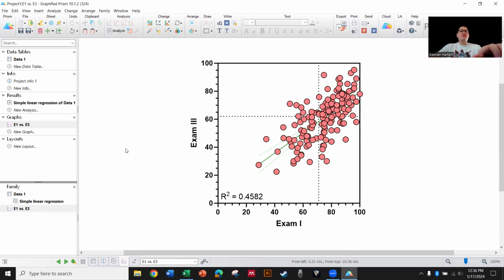If you're running a bunch of repeated analyses too, you can actually set up an R2 equals with nothing next to it and then copy paste this value from in there. It'll automatically show up. Again, that didn't take me too much time though. So if it's one of those, that's easy. Otherwise, yeah, you can get some pretty good stuff done.